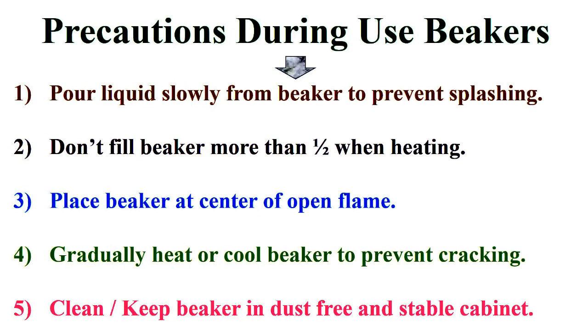And when working with beakers, pour liquid slowly from the beaker to prevent splashing, and don't fill the beaker more than half when heating, and place the beaker at the center of the open flame, and gradually heat or cool the beaker to prevent cracking, and clean and keep the beaker in a dust-free and stable cabinet, as mentioned inside the slide.